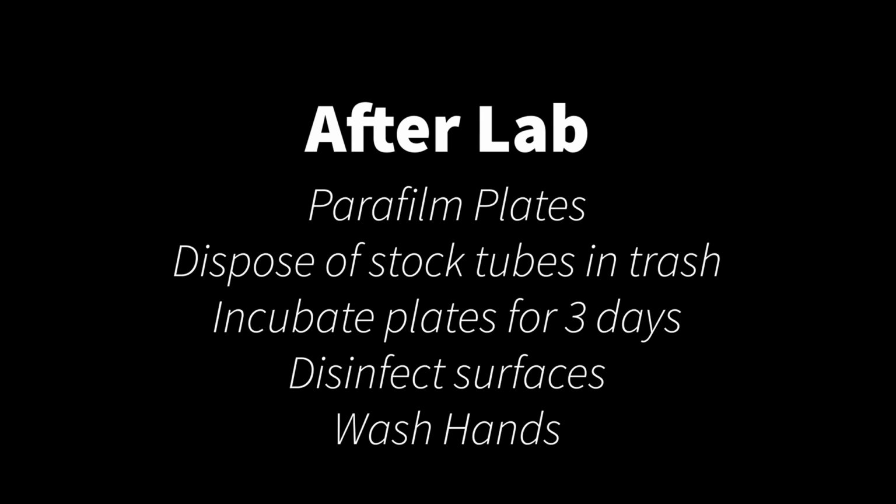As with all the labs, you want to make sure you disinfect your surfaces and wash your hands when you're done. The stock tubes that you use to set up your plates are now finished, so you can dispose of them in the trash.